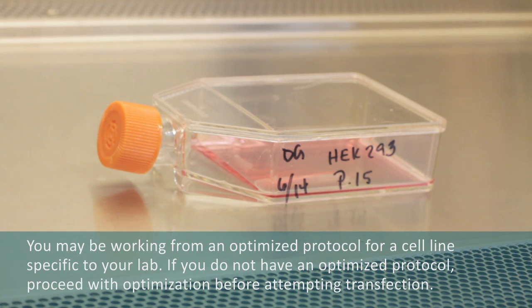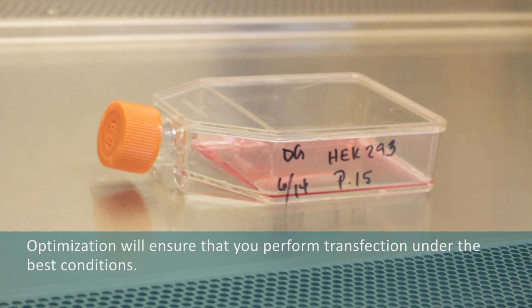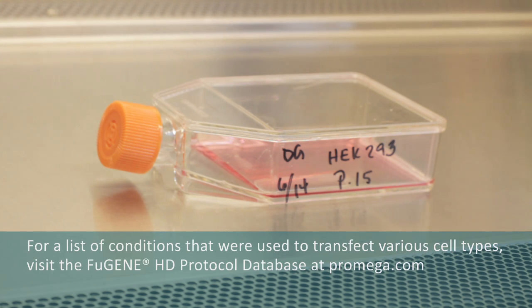If you are working from an optimized protocol for a cell line specific to your laboratory, excellent! If not, proceed with optimization before attempting transfection. Optimization ensures that you perform transfection under the best possible conditions. For a list of conditions that have been used to transfect various cell types, visit the Fugene HD protocol database at promega.com.